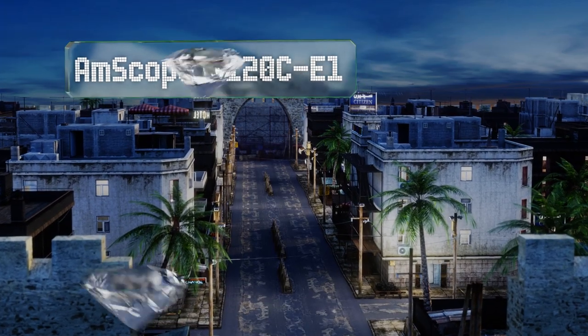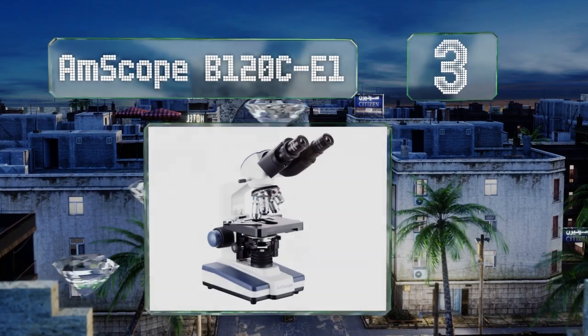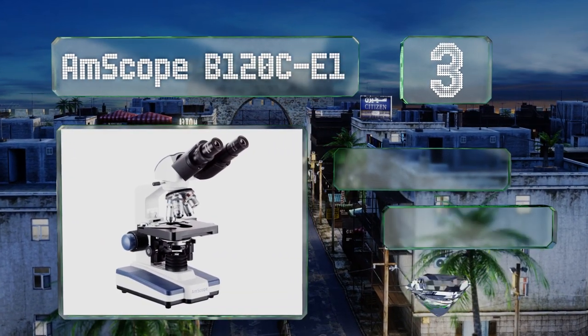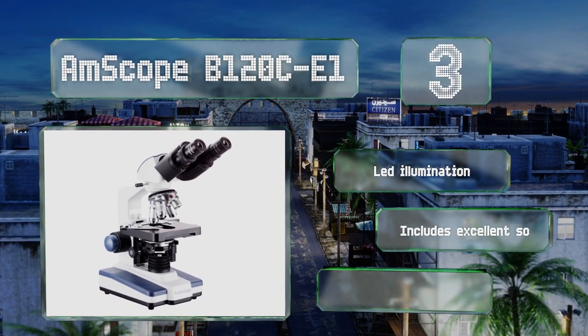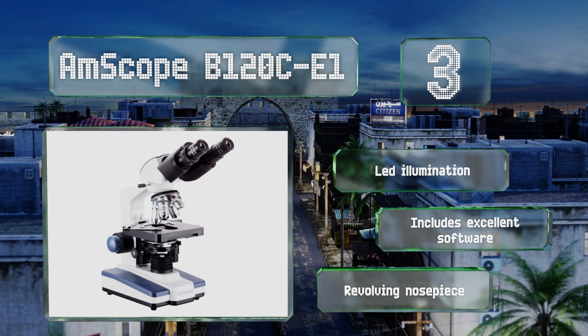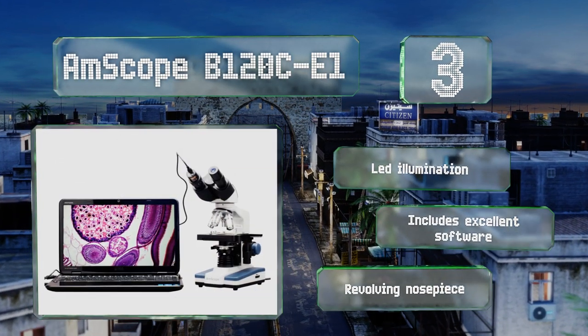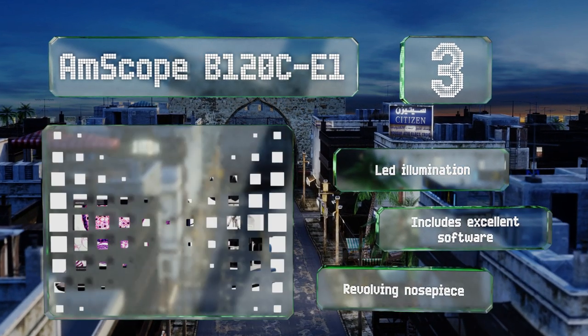At number three, the AmScope B120C-E1 is a Siedentopf binocular model that allows you to remove one of its magnifying eyepieces and replace it with an included 1.3 megapixel camera. Its durable mechanical stage offers fine incremental adjustments. It's equipped with LED illumination and includes excellent software and a revolving nose piece.